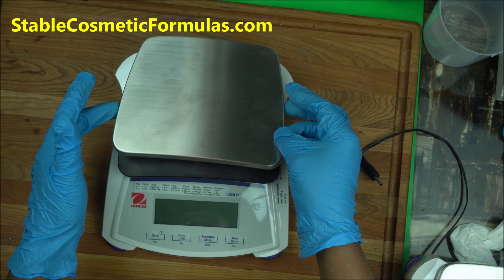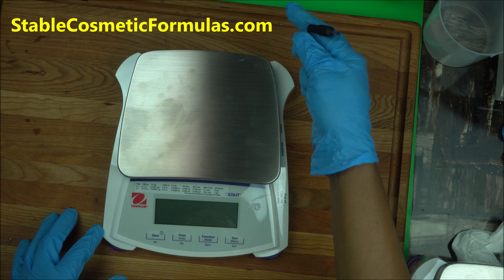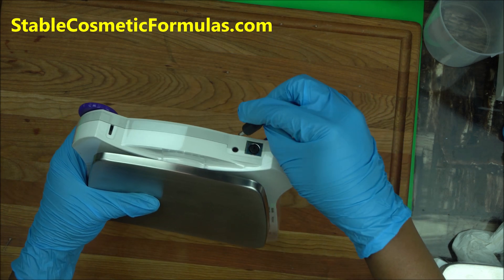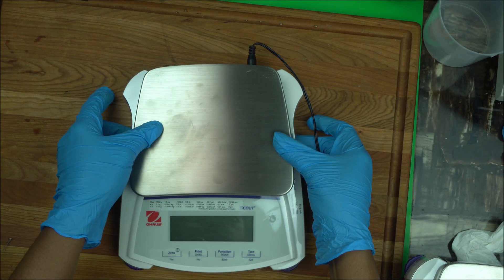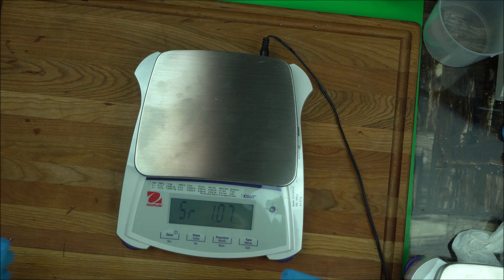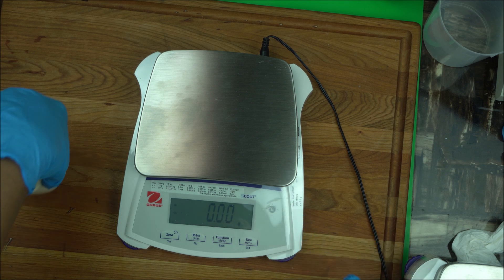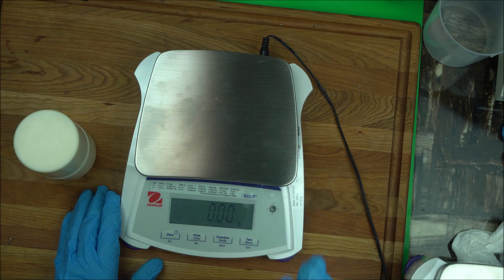Then plug in the adapter that comes with it into the adapter slot. When you first turn it on, press the zero button to turn it on. The first thing you want to do is calibrate the scale. You're going to need different calibration masses to calibrate it. I'm sorry about the background noise.